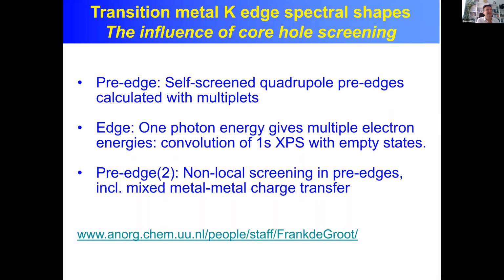But I don't know by heart if that has been measured or how the spectrum looks. And will there be an effect? Because experimentally, when you look at the nickel, there seems to be a Jahn-Teller-like thing, because you have two different nickel-oxygen bond distances from the EXAFS, which would be more like a traditional nickel 3+.